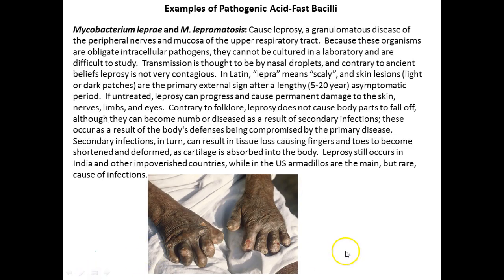So let me give you examples of some pathogens. Mycobacterium leprae, and again, remember I said mycobacteria are what are going to stain acid-fast, that particular genus. So leprosy is caused by a mycobacterium. I actually worked in research with leprosy, had to do this stain numerous times. We were trying to count these bacteria from animal and human samples, and this still exists even today. Leprosy does.